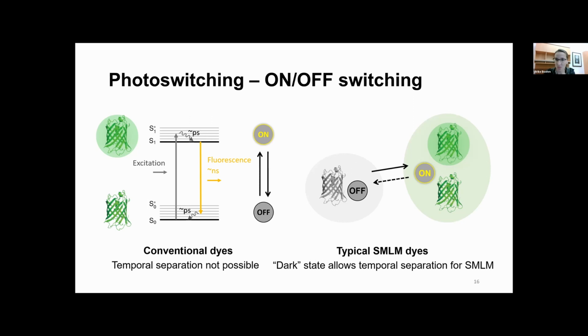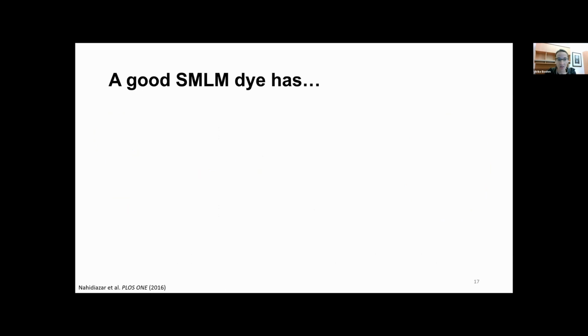And that's also why it took this technology quite some time until it could be realized. Because the idea for single molecule localization microscopy was already there a couple of years ago, even way before Eric Betzig and Harald Hess published their famous PALM paper in Science in 2006. But it was hard to realize because exactly this type of switching between dark and bright states was not really possible. So, what are the exact properties of such a dye?